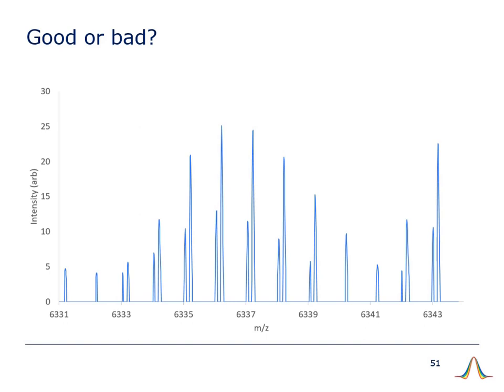But do you remember this example from the beginning of the video? This is a case illustrating the perils of ignoring the information in the side lobes of an absorption mode spectrum. This spectrum looks like it shows two overlapping isotopic distributions with the same charge state. But looks can be deceptive, and this kind of thing can be dangerous.